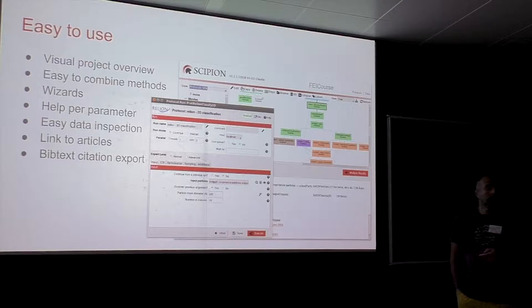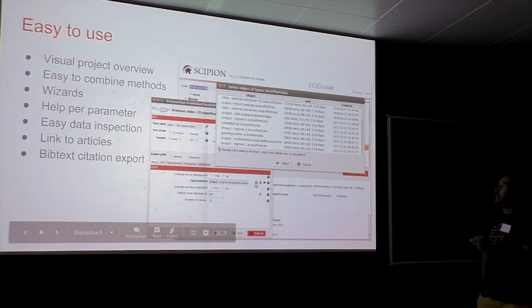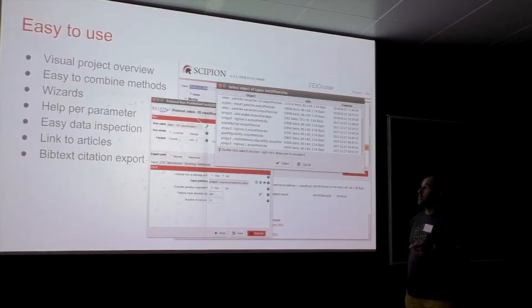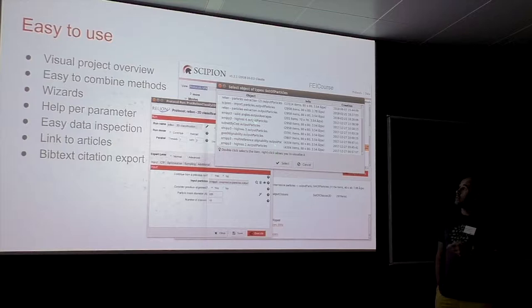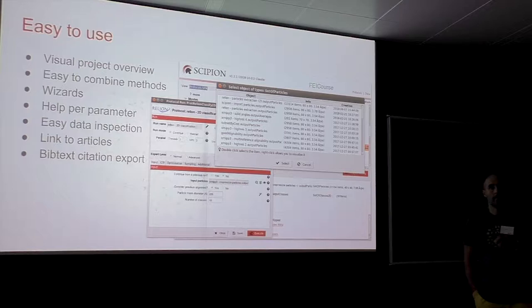How do you combine methods? From the user's point of view, it requires no effort. You just link one box to the other by clicking on the connector, and Scipio shows all outputs available within your project that have a compatible type. For example, 2D classification in Relion requires a set of particles, so it shows all methods outputting a set of particles — whether from Relion, Scipio subset operations, XMIPP, or any other package.